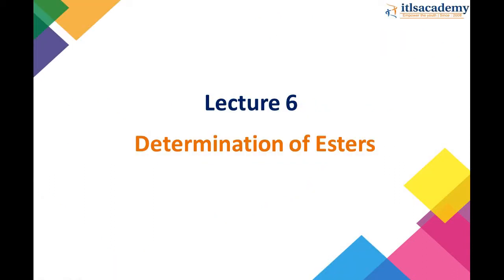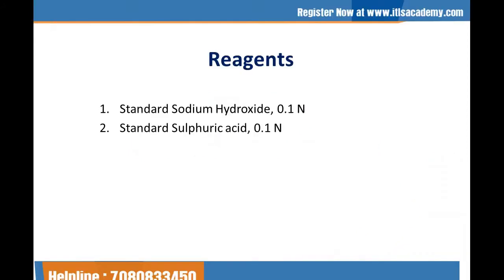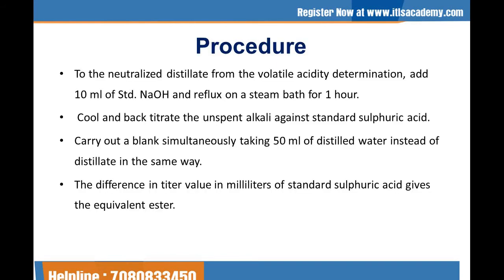The topic for today is determination of esters in alcoholic beverages. The main reagents required for this experiment are the standard sodium hydroxide solution of 0.1 normality, and the standard sulfuric acid of 0.1 normality.